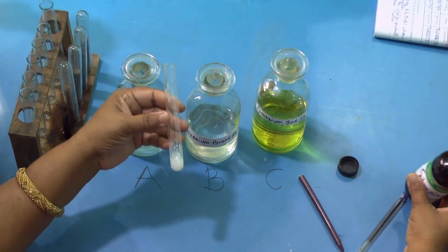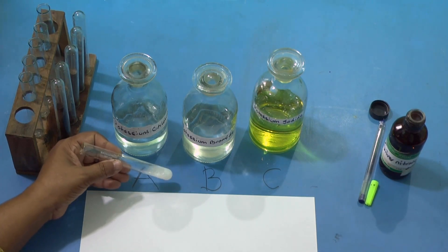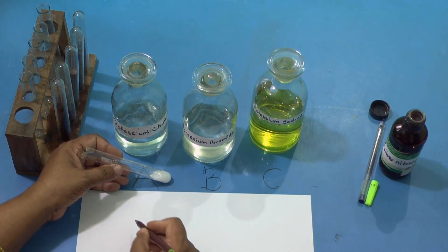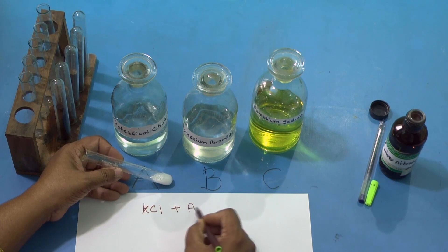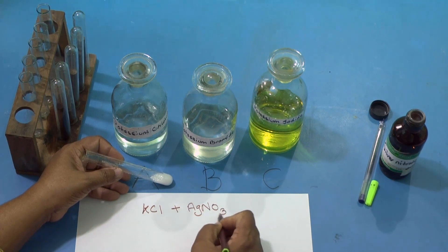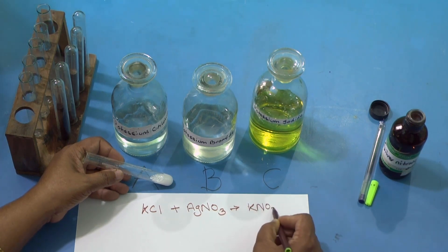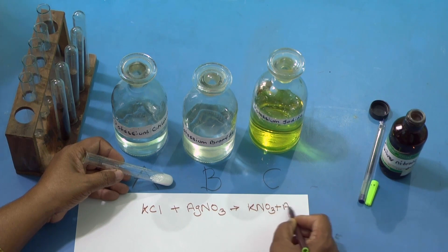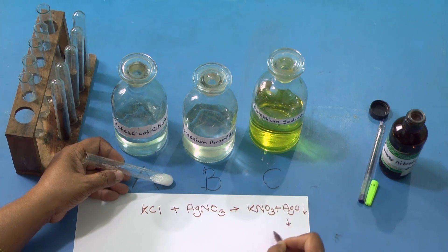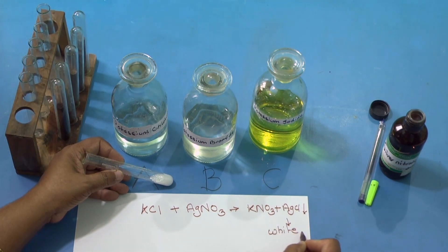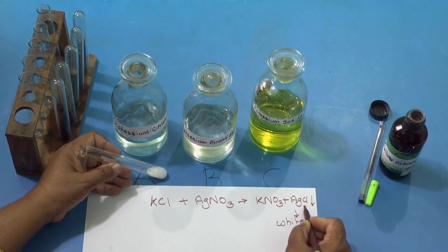We got white PPT — very clearly we can see white PPT. Children, the solution was of KCl. I added AgNO3 and it gave me KNO3 plus AgCl precipitate, which is white in color. White PPT is AgCl, formed by potassium chloride. So this is the test for the chloride radical.